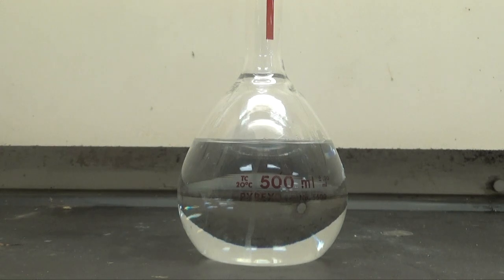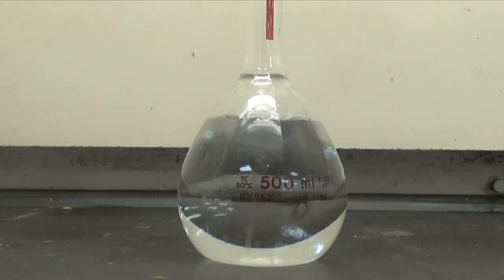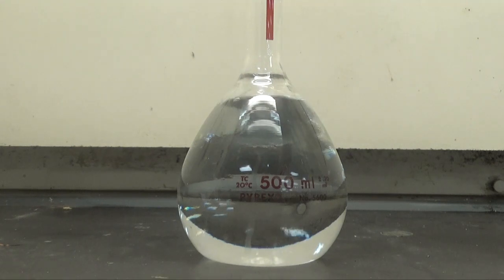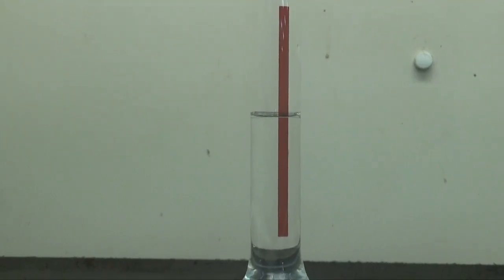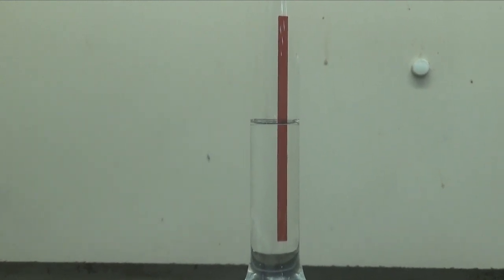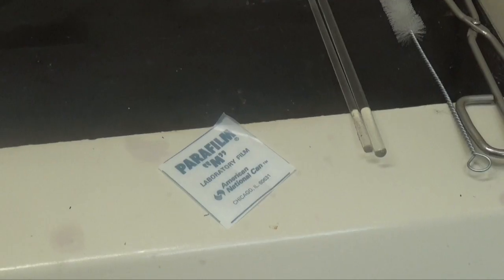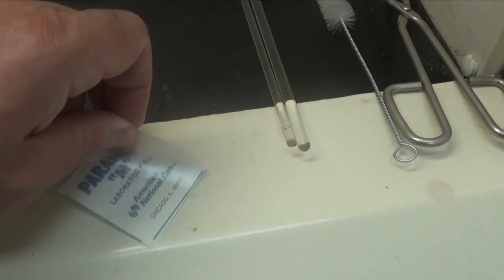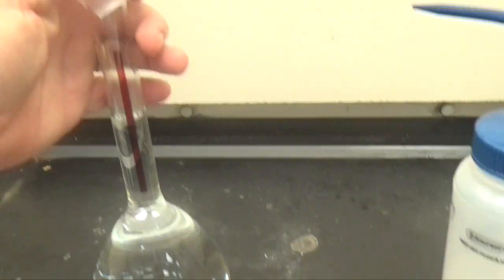Now that the concentrated acid has been added, I'm going to pour in distilled water to where we're close to the mark, and when we get close, I will add it drop by drop to get us to the mark. Notice that the meniscus is on the line, indicating that we have 500 milliliters of 4 molar hydrochloric acid. I will now take a piece of parafilm, which is unreactive material, and put that on top so I can seal this and mix it.